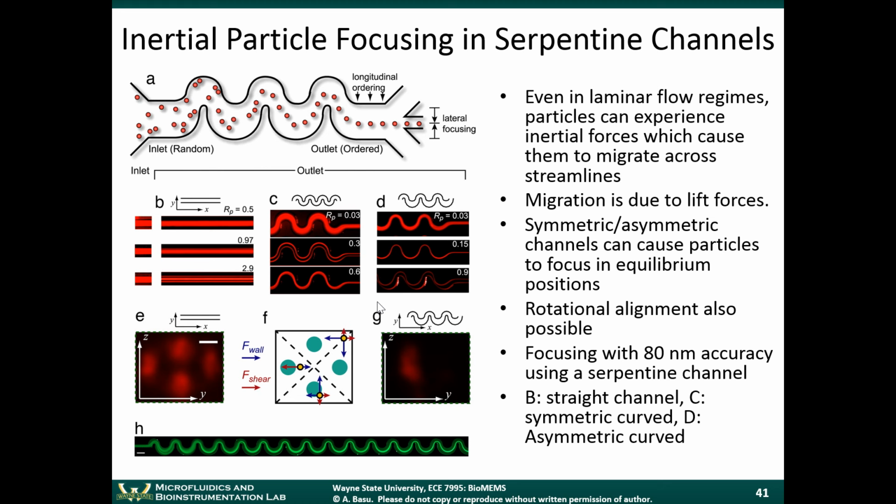places in the channel. And then later, it took them a while, but they eventually started to understand why it happened. So they did a lot of modeling. They looked at a lot of old papers on it, and this is what ultimately led to these slides that I'm showing you right now, the inertial focusing techniques. The concepts were discovered back in the 50s and 60s, but they were only applied to microfluidic devices in the last 10 years or so.